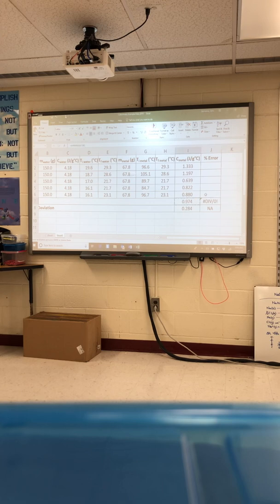What does that mean? She's confused. That means that right now it's confused because I don't have numbers in here. Oh. So it's saying that I can't divide by 0. Got it. Okay, now, next part, we need to find our percent error.